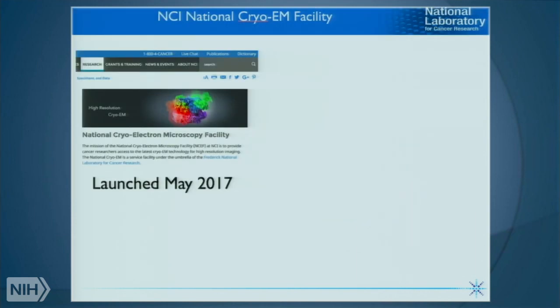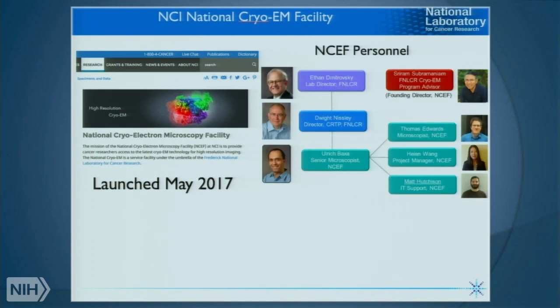And in a small way, we have already started to do this at the NCI, thanks to the support of Harold Varmus and Doug Lowy, who supported a proposal that I wrote to begin to launch a national facility at the NCI that could begin to disseminate this technology to the extramural world. Right now, we have a single Krios microscope. There will be 2 this summer and perhaps 3 the next year.